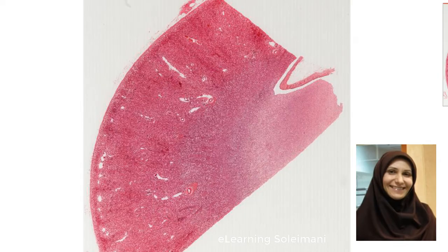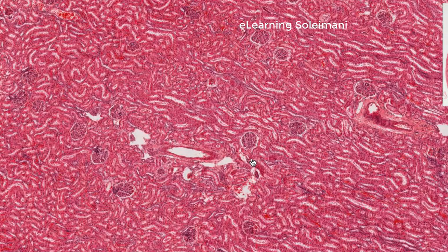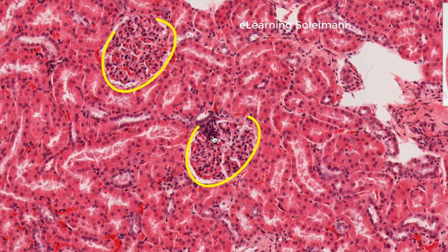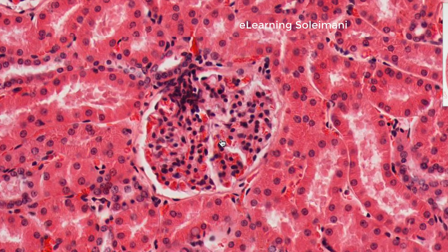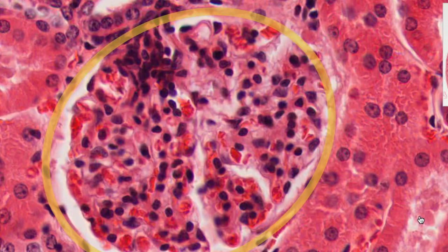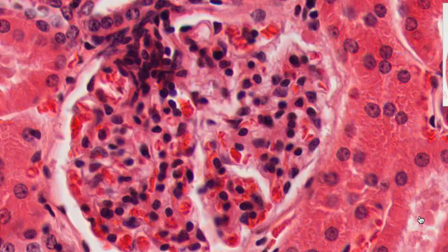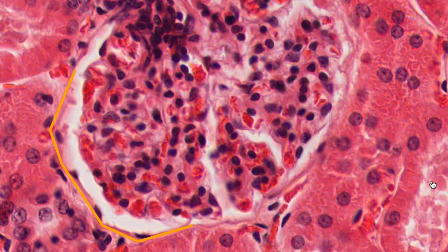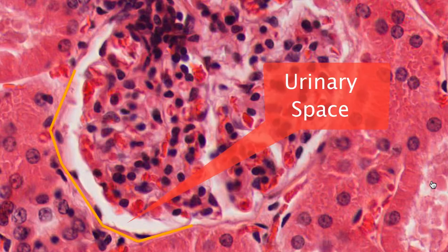The slide shown is the kidney, which consists of the cortex and medulla. Higher magnification shows the Malpighian corpuscles. The Bowman's capsule, containing simple squamous epithelium, is situated around the Malpighian corpuscles. This is a single-layer polarized epithelium whose basal surface is located on the basal membrane and its apical surface is toward the urinary space.